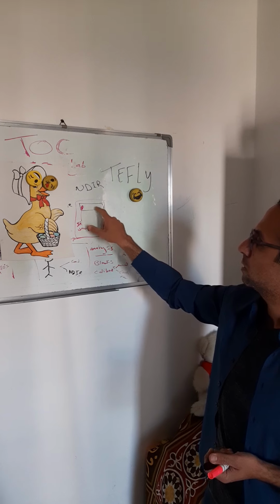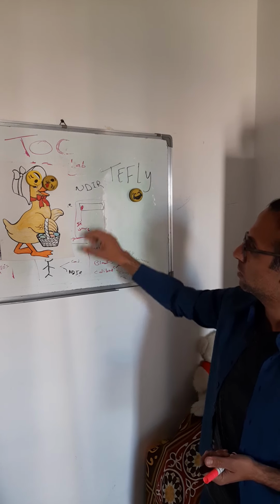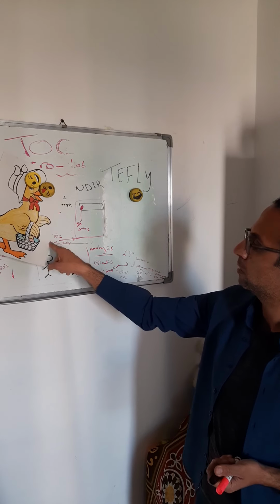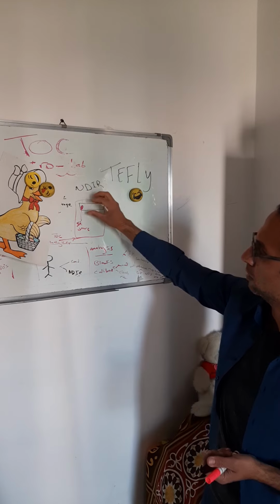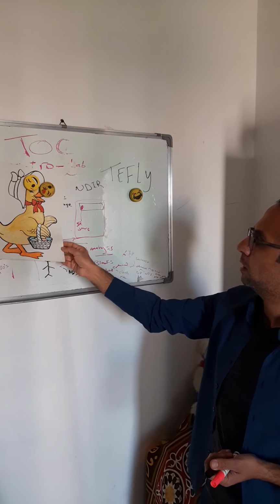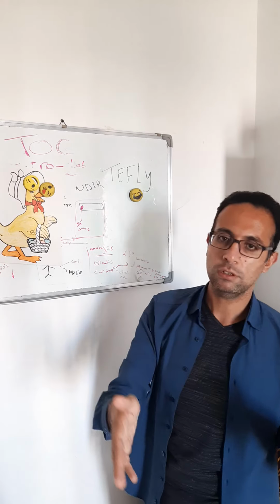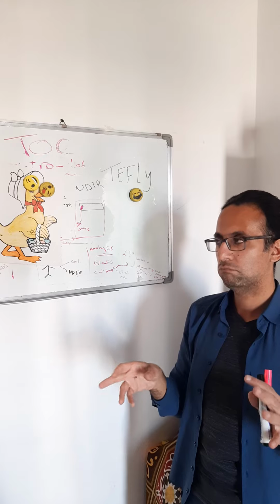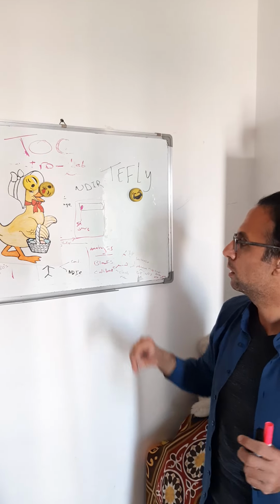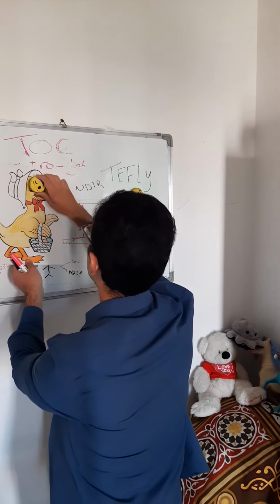So this is the detector. It takes this shape, integrated inside the TOC analyzer itself. Here, this is the TOC, and the detector is a part of the analyzer. But as we said in the analysis stage, we have UV and combustion. Also in detection, we actually have two types, I think, mainly. Yeah, NDIR and the other type.